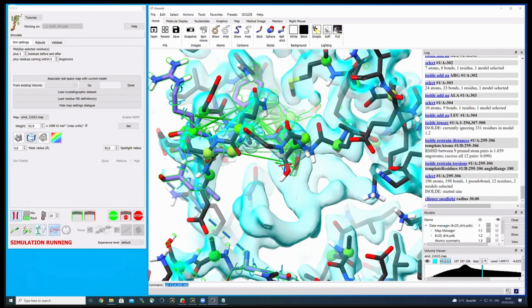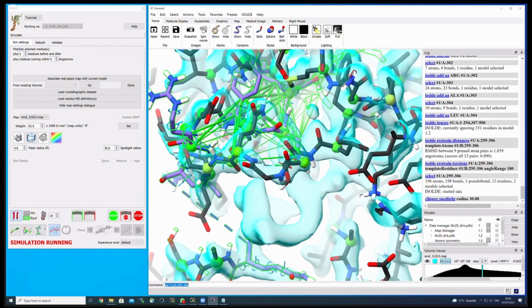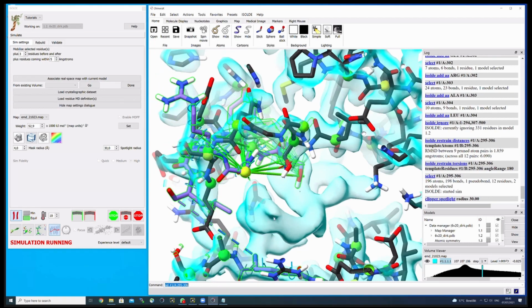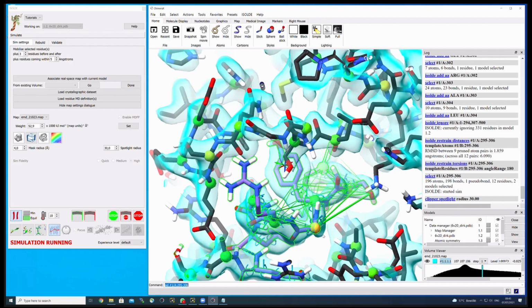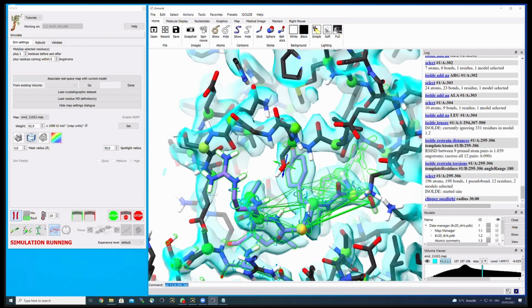tuck these residues, and we can either do this with the button down here. If you click on this one, all the residues that are currently selected will be moved as a whole. But since there are restraints applied that keep them in their position anyway, you can also just basically drag one of these residues and try to move it down. And when you've done this, you're essentially done with the model building, except for some local fixes.